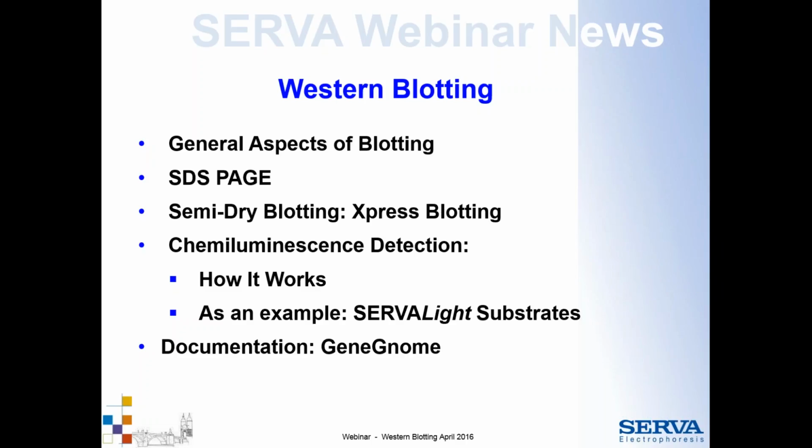After this, I will talk about the chemiluminescence detection, how it works, and give you an example of the SERVALight substrates. And last but not least, the documentation is also a point, so I will introduce the GeneGnome to you. So let's start.